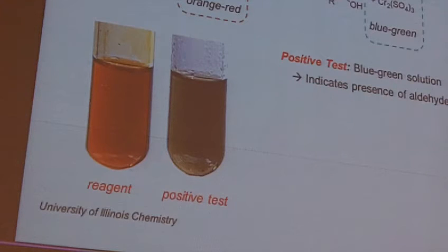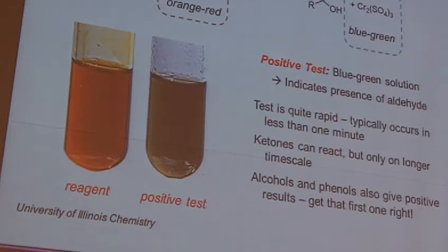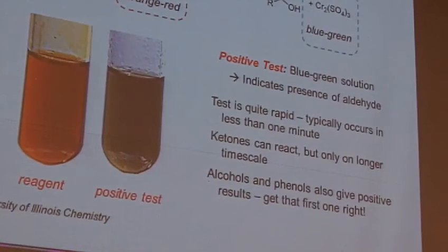And again, the reason for the color change is the formation of this chromium sulfate species that's in there. That's going to give you that color change. That'll tell you that oxidation is happening, which means you have an aldehyde, if that matters. One little heads up, or several heads up. It's a rapid test. It's going to happen very, very quickly. Ketones eventually will slowly get there and form some of this byproduct.